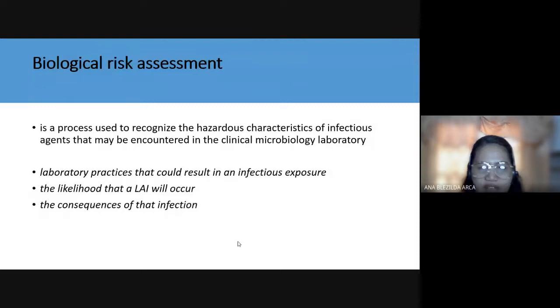Now, for the biorisk assessment, this is a process used to recognize the hazardous characteristics of infectious agent that may be encountered in the clinical microbiology laboratory. So you're going to study what are the different laboratory practices that can actually cause infectious exposure. So ano daw ba yung mga pwede mong gawin that can lead to the exposure of that one?